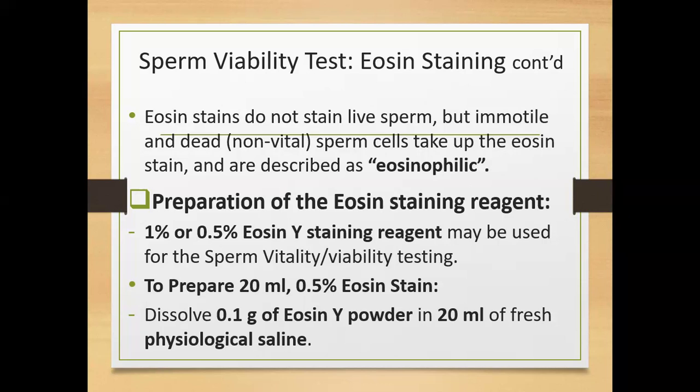Remember that I've told you that if you're doing your sperm count and your diluting fluid is finished, what did I say is a stop gap that you can do? If your reagent gets finished, what can you do? You can substitute it with water.